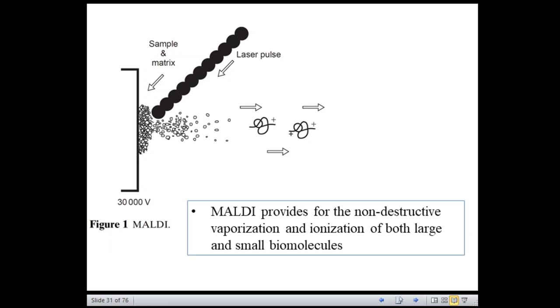No fragmentation is shown there. That's the reason MALDI is said to be a non-destructive vaporization and ionization method, which is applicable for both large biomolecules and small biomolecules.